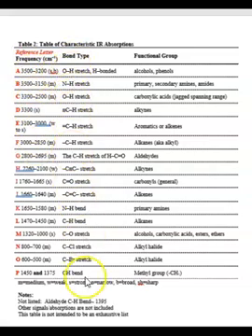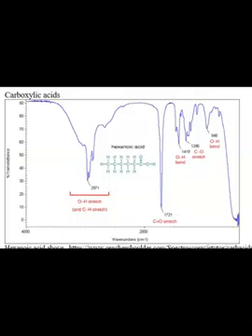So generally we'll talk about bond types, but what we're really saying is that these bonds stretch and bend, and there's any other number of ways to respond to infrared rays. And that tells us that if you have an OH group, you have an alcohol. And so we went through all of these to say that if we see a peak on a spectrum, come back to this table, and it might help you narrow down what you believe might be in the structure. And in our final walkthrough, this is called a spectrum. It's not really called a graph, it's called a spectrum. If you have more than one, it's called spectra.